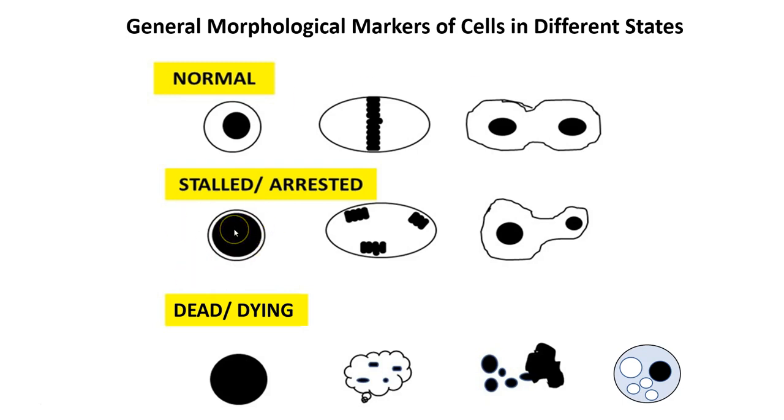In the simplest of these states, you would still see a cell membrane similar to how you saw in the normal cell, a typical cell. However, this time, the nucleus inside is going to be pretty large. It's going to be significantly larger than a typical cell, and it is going to sometimes even take up almost the entire space of the cell inside the cell membrane. By definition, we usually say a typical cell shouldn't have a nucleus that takes up more than 40% of the total cell volume.